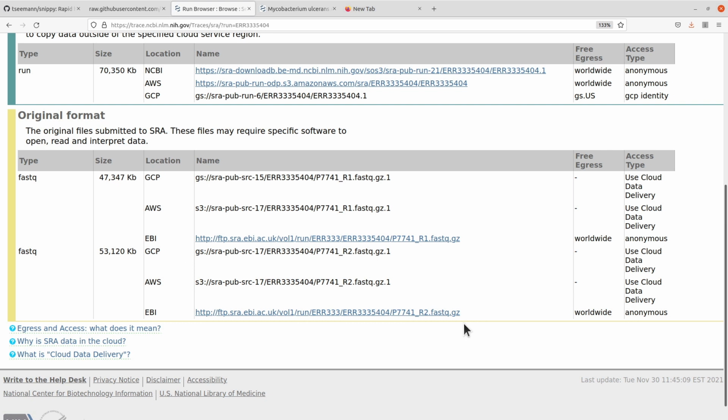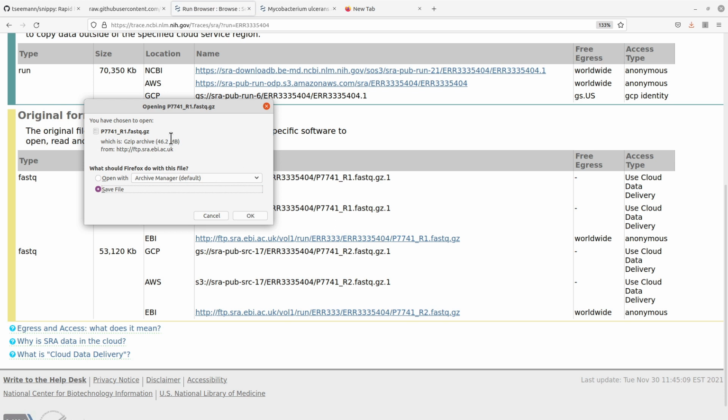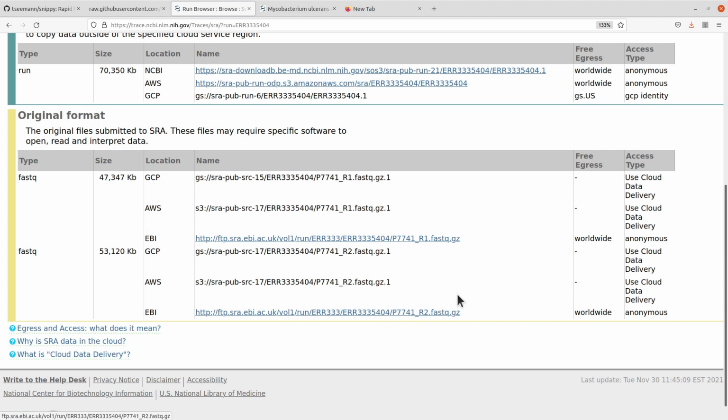So let's go to the terminal and do it. But let me also say, in addition to using the terminal, you can download using the browser. If I click here, I'll be asked to save it, so you can use that to download both. But if you are working on a remote server where you have access to only the terminal, then you can do everything straight from the terminal. So let's go to the terminal and download these files. Make sure you have copied the links.